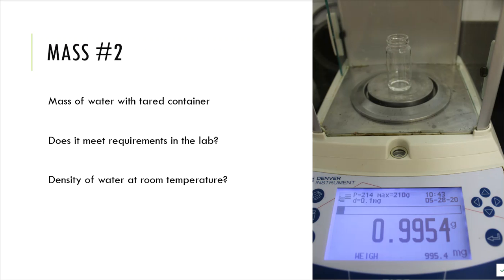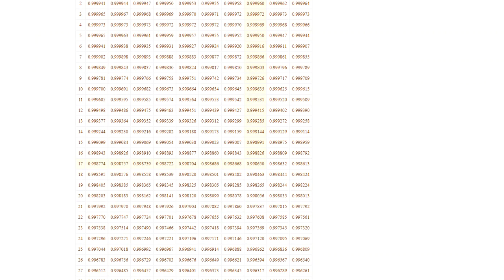Because folks, sometimes you'll come into the lab and you mess up. Sometimes you come in and you get it right. And this could be correct or it could be incorrect, as well as everything else that I will show you from this lab or in future labs. That's just the way that I work here. So I always double check you to make sure that you're paying attention. All right, so there's the volume of 1 milliliter of water, what I think is 1 mL, and there's the mass of that 1 milliliter. So see if that matches the expected table that you have on your end.